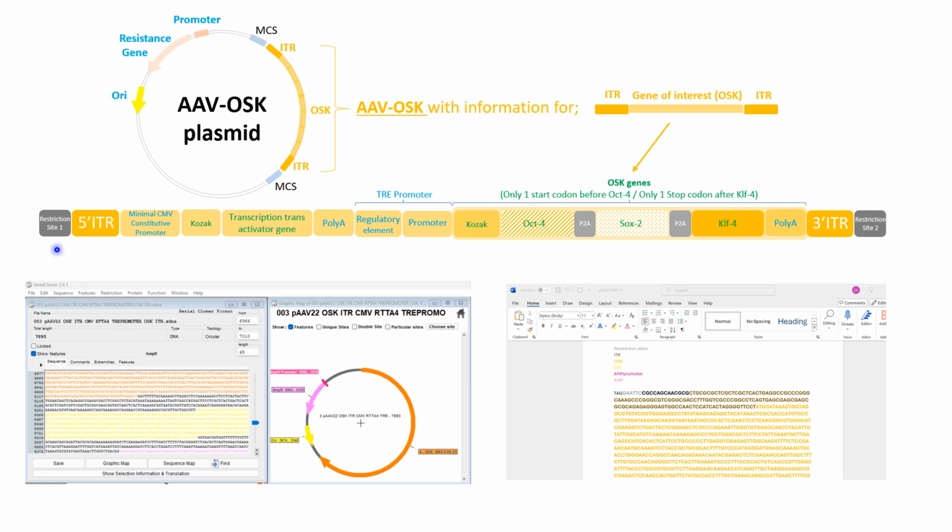Let's go for it. You see here, let's remember a little bit the parts. Okay, the restriction site 1 and 2, flanking the whole sequence. Then you have the ITR sequence, the 5' and the 3'. These are, remember, the labels to amplify this region and to encapsulate it in the adeno-associated virus. Okay, and then you have the 2 cassettes of genes, this first gene and the second cassette of genes.